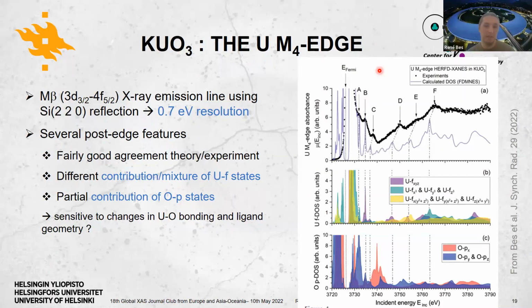That's true. It's a good opportunity to have lots of positioning in energy of many features because of the improvement in energy resolution. And then it's a good opportunity to compare with calculations and understand better if the calculations are failing or are giving very nice results and how to improve them.